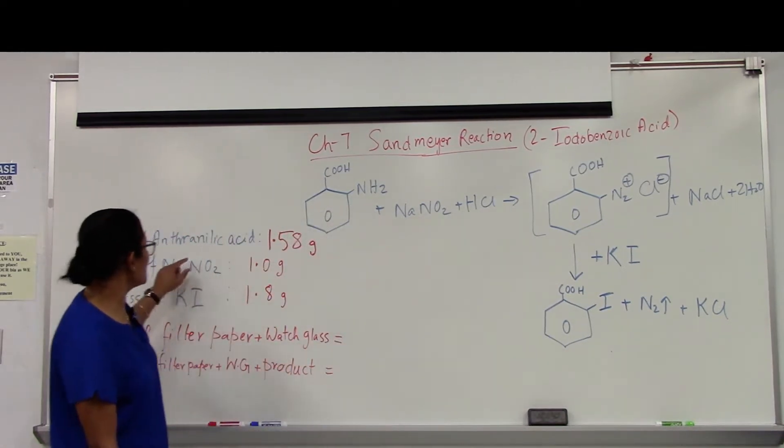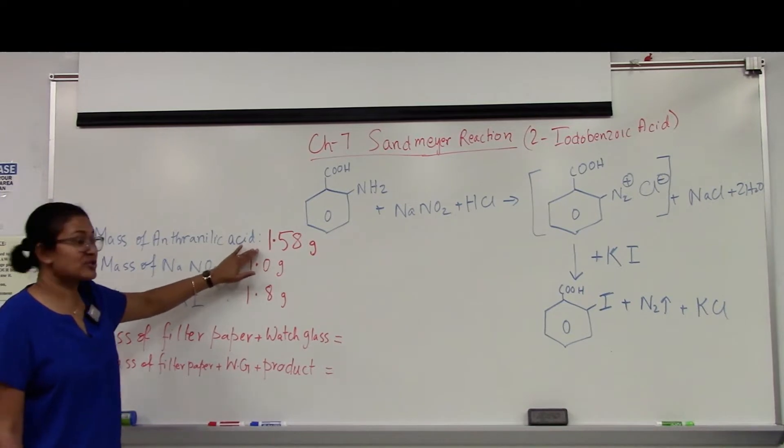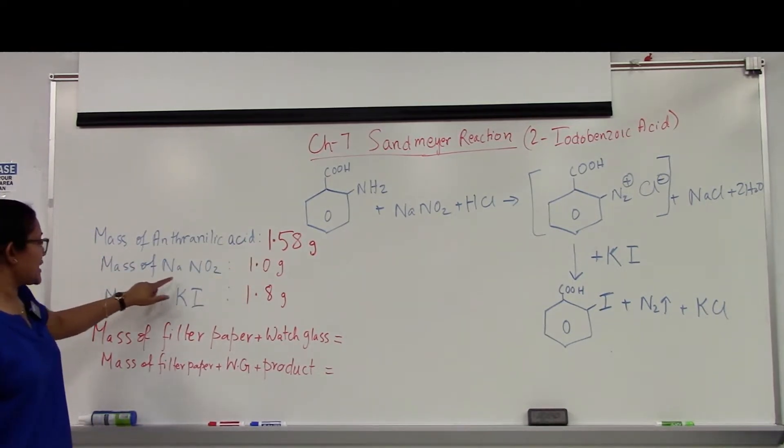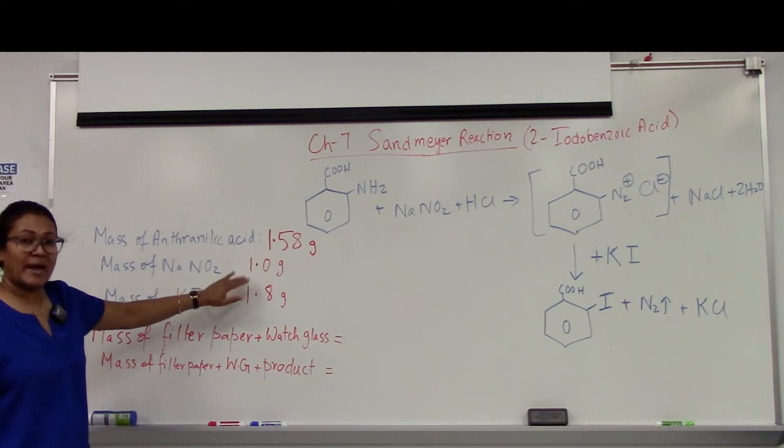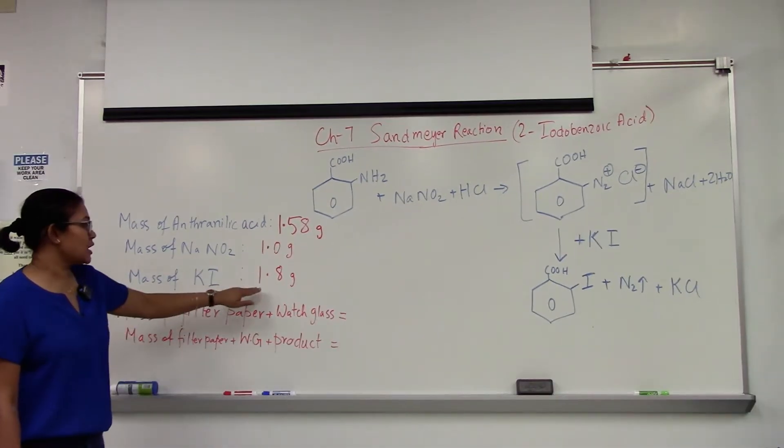I'm starting with 1.58 grams of anthranillic acid, 1.0 gram of sodium nitrite, and 1.8 grams of potassium iodide.